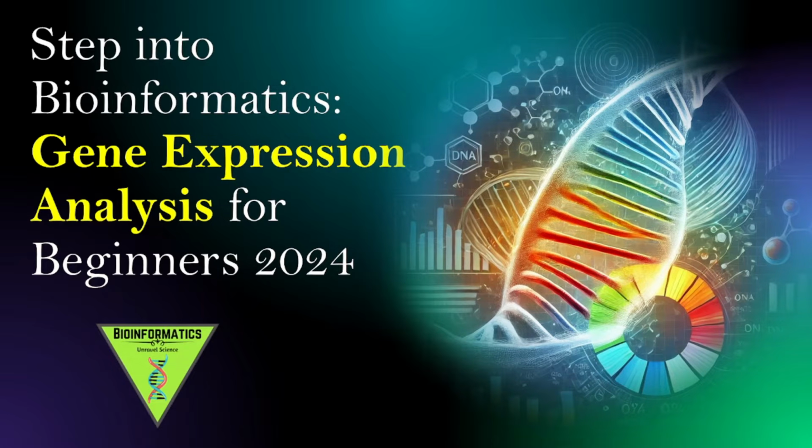Okay, so let's dive into our new series on gene expression analysis. In today's session, we are going to learn about the basic web-based platform GEO2R, and how we can perform gene expression analysis. Okay, so let's start.